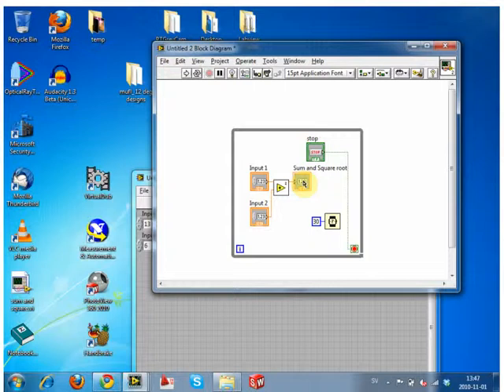Doesn't matter. Yeah, exactly. Okay, and it's got a file save. No, just save. Don't save it as anything, just save it. There you go. So if we save it as something other than that, yeah, if you save it as something, it'll make a new version of it, but then your VI won't have that built in. You'll then have to replace.